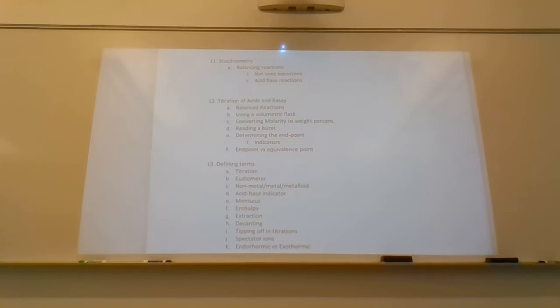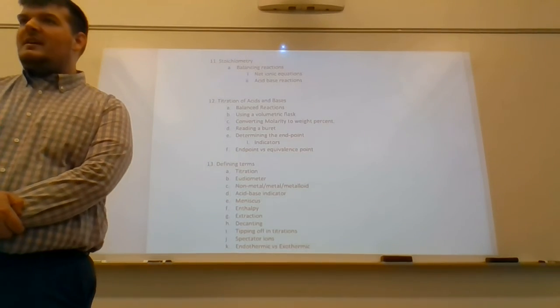So whatever pH your indicator changes colors, whenever it changes colors, you'll know that it's that pH. We use phenolphthalein. We could look it up in our books, it tells us at what pH phenolphthalein turns colors. I can't remember off the top of my head. I want to say it's like 8 point something or 9 point something. But it says basically that phenolphthalein changes colors at this pH.